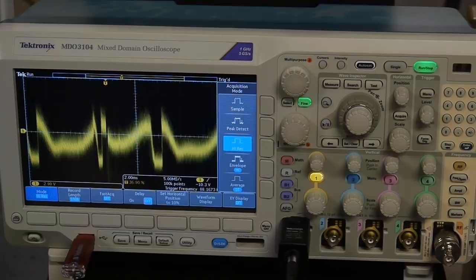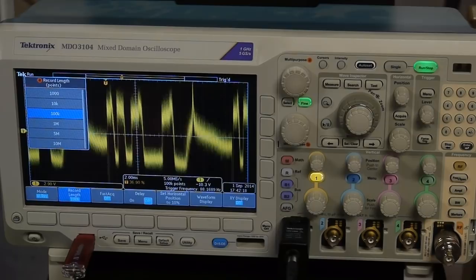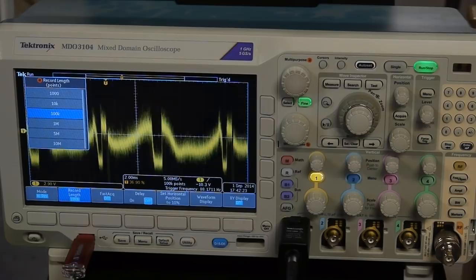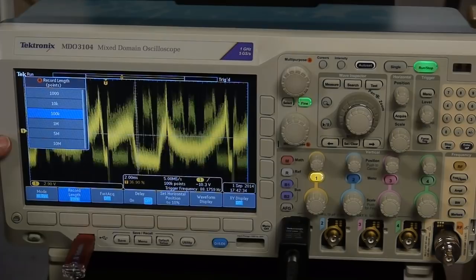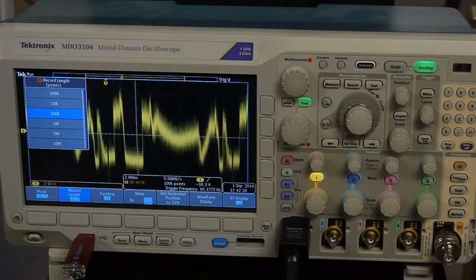Next we're going to change the record length. Since we know that the whole scan is going to take 10 seconds for the scanning electron microscope to finish, and we want at least a 1 megapixel image, we're going to want to record at least 1 million or 2 million points. Our options are 1 million or 5 million, and 1 million is probably not quite enough, because we're going to lose some of those acquisition points to the horizontal sync pulses. So I'm going to change the record length to 5 million.